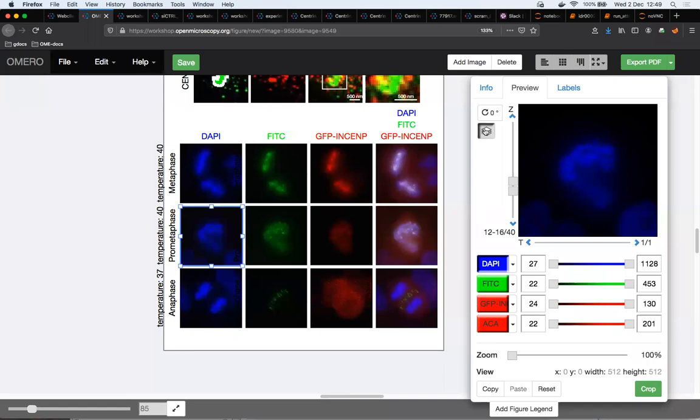Whereas here, whilst you are still in the very late stages of the preparation of your figure, you can very easily double back on yourself and correct all your mistakes by simply sliding those sliders. Good.